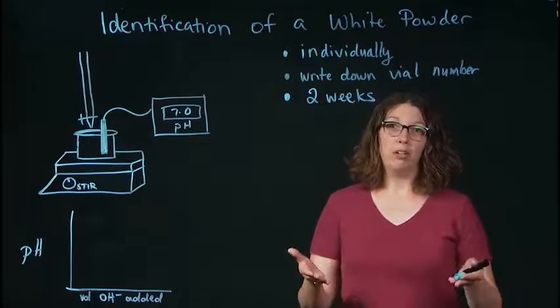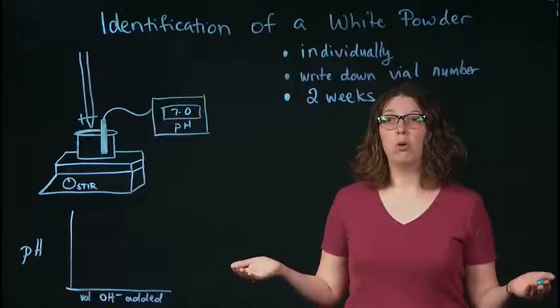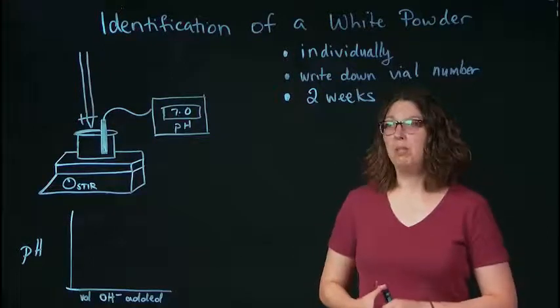Without that vial number, we can't tell you if you've come up with the correct answer, and we can't give you a grade. So make sure you write that down. That should be the first thing.